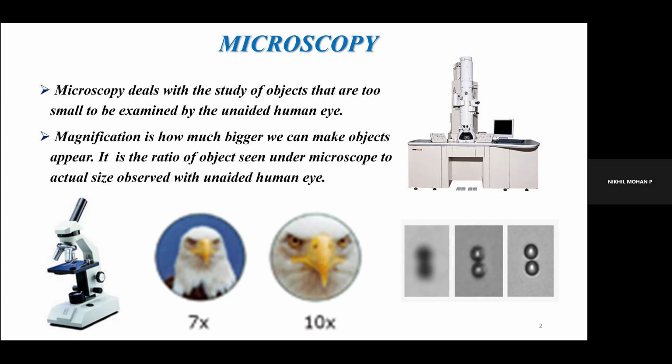Okay, so next is aberrations. So what is aberration? In optics, this is the major issue, we need to compromise with the resolution, because in theory the optical microscope resolution is about 200 nanometers, because the resolution of a microscope is lambda by 2. Lambda is the wavelength of the source that we use. In an optical microscope, it's about 400 nanometers, so the resolution should be 200 nanometers. So theoretically we could see much smaller particles with an optical microscope, but we cannot. That is because of limitations like lens aberrations.